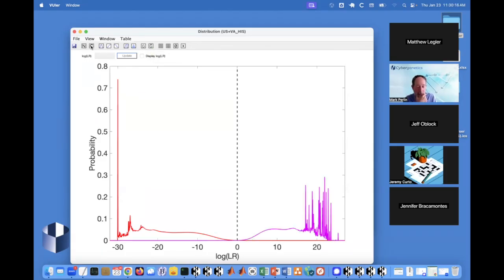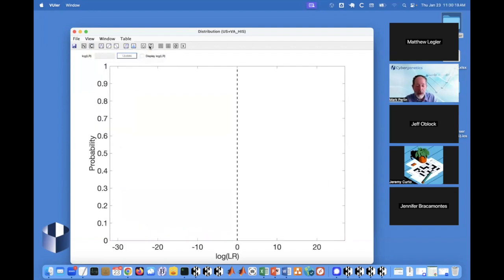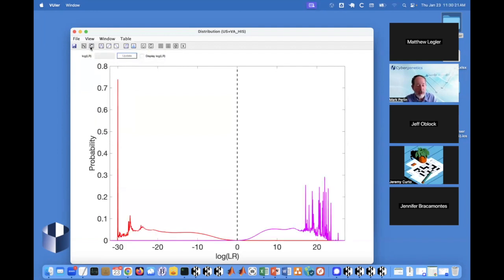The contributor side of that. Turn that off. So show just the left. And now we're going to show you the one-band binning. This is showing it to you at a milliban resolution, 1,000 points per ban. But what we saw in the validation paper was binned by powers of 10.